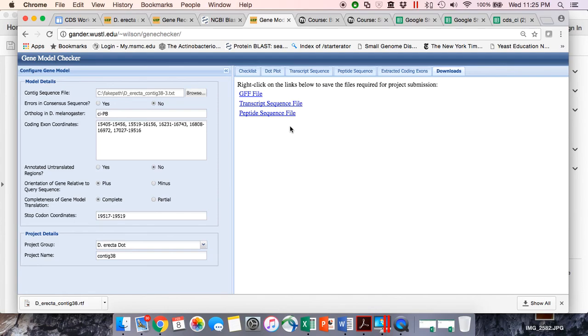What's important now is that you're learning how to put together your annotation. When you get to the end of your first isoform, let me know. We'll talk about the best way to save these files so that when you do have to put together your annotation report, you can do it relatively quickly.